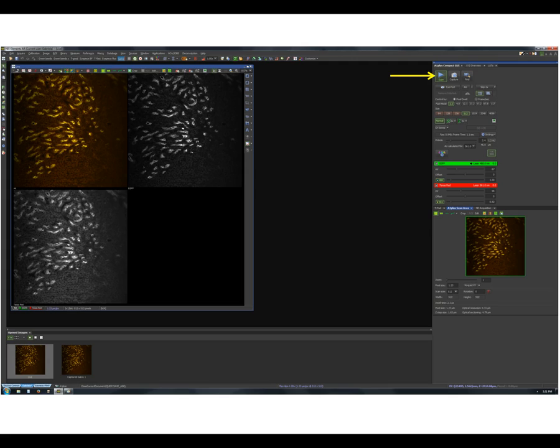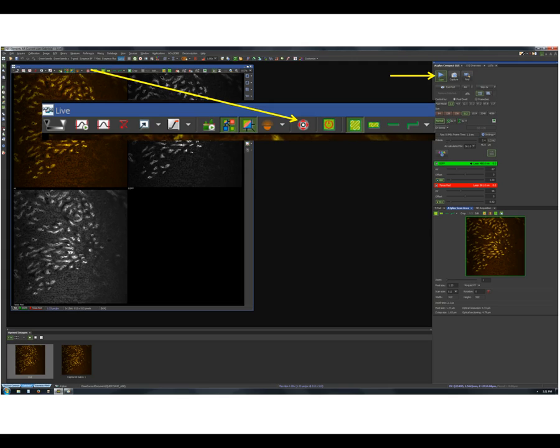While scanning, by clicking on this button, you also have the option to move the stage by dragging the image. You have now learned the five steps you must follow when you start NIS Elements. You have also learned how to set the light path, zoom in and out and move the scan area.